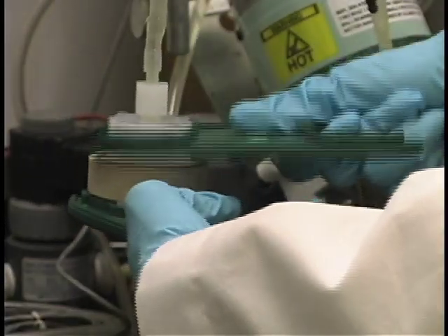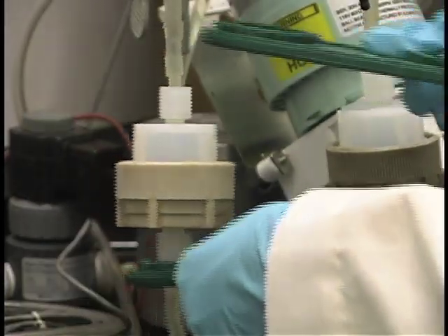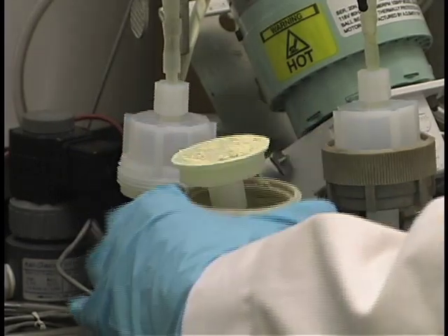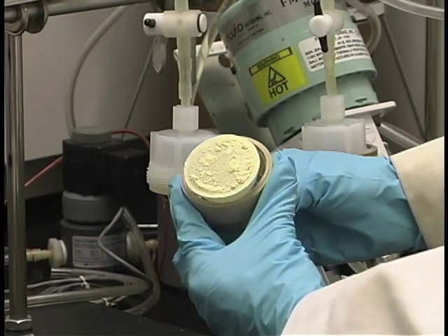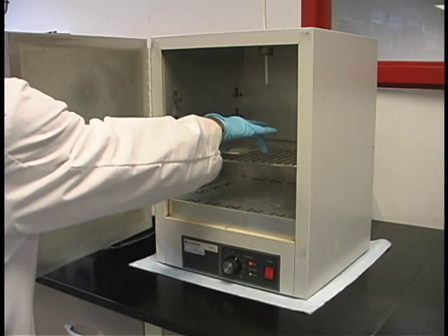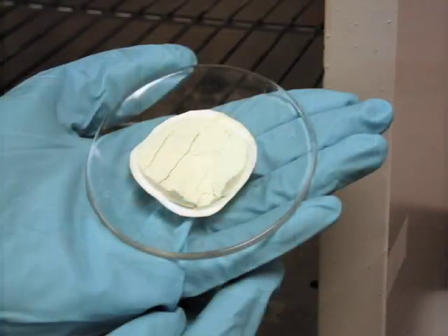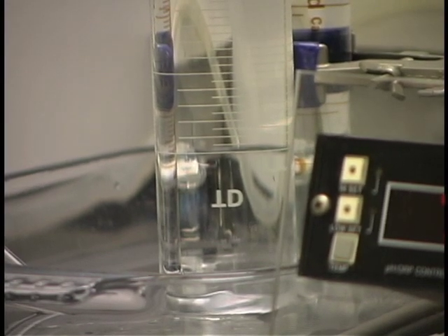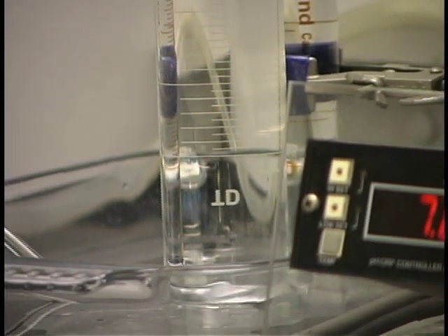This feature enables the operator to remove and clean one of the filters while the system is still running. Here the operator demonstrates how a filter can be taken offline while the system is operating and continue collecting the sulfur through the other branch. The sulfur is typically dried and weighed to confirm the mass balance of the overall system. The collected gas has been shown to be mostly hydrogen, but it is of interest to know how much H2S is co-evolved and correlated to the operating parameters of the system.